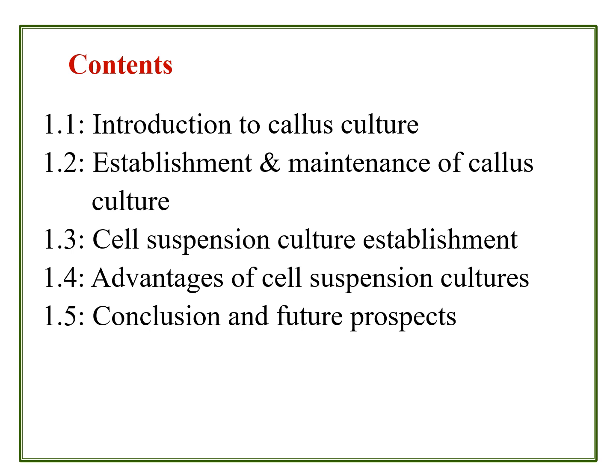And the next topic is cell suspension culture establishment. So cell suspension cultures are more advanced cultures than the callus cultures and offer wonderful products for the benefit of human society. Then advantages of the cell suspension cultures, and then conclusion and future prospects of the callus culture and suspension culture.